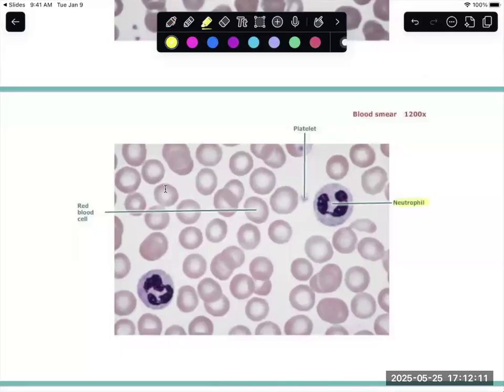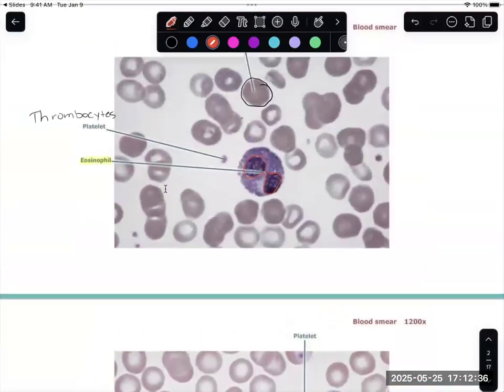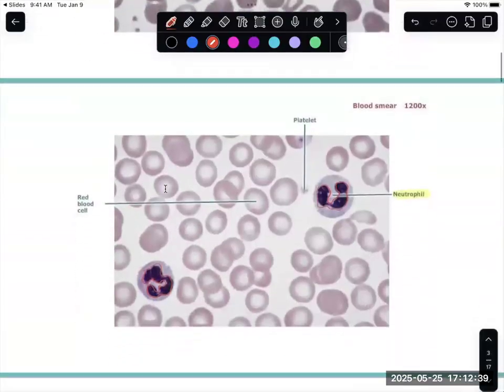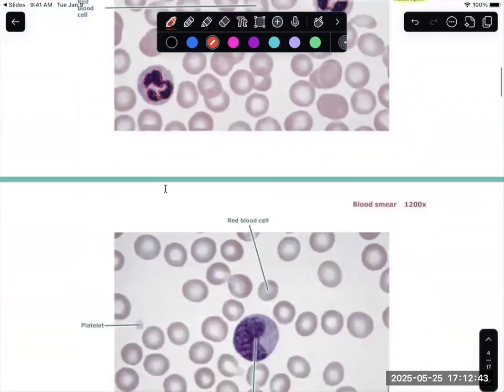So these neutrophils, there's 2 of them on this picture. They have this chain like nucleus that travels throughout. You can see how this one has this little chain like picture that travels throughout this entire area. That is how we tell our neutrophil versus this bilobed nucleus in the eosinophil. Here you can see more of a chain for this specific nucleus.